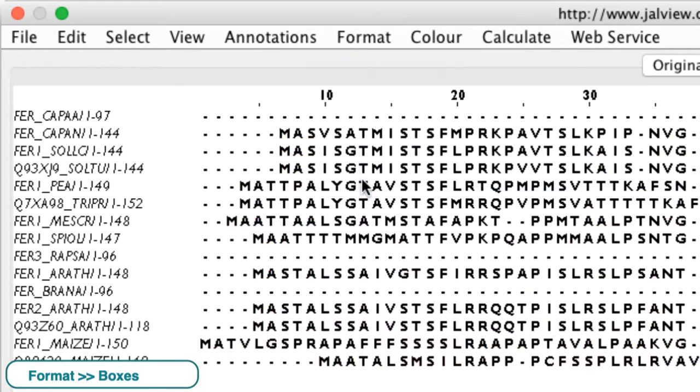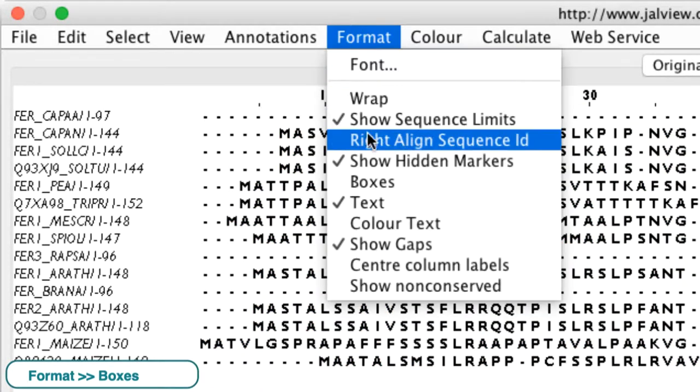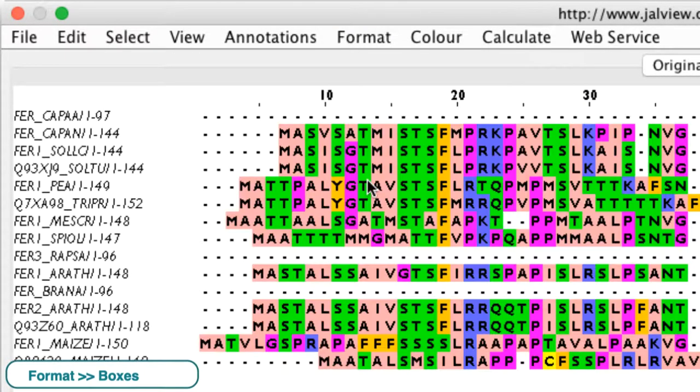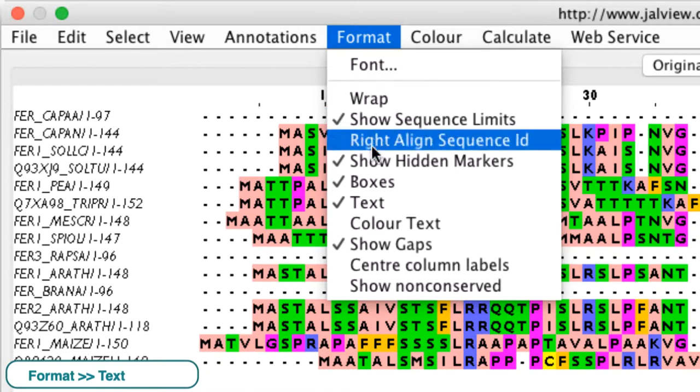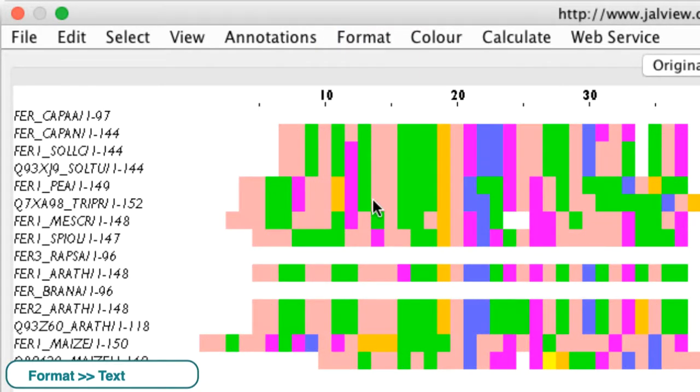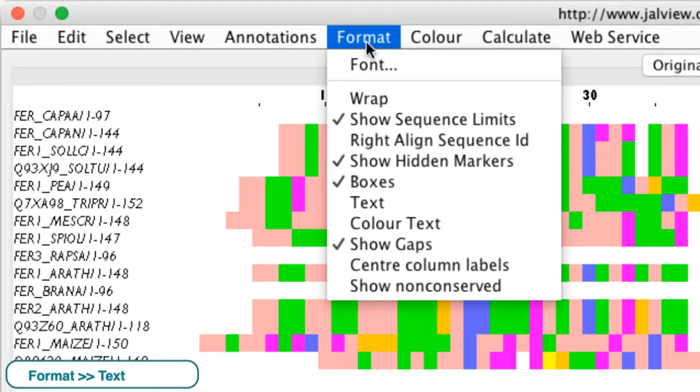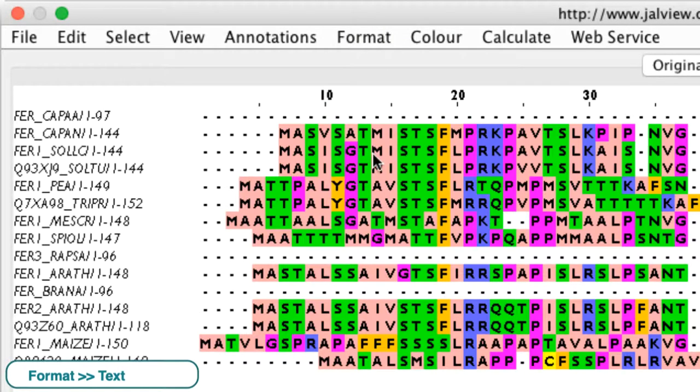Boxes toggles the background color of the residues either on or off. Text toggles the one character amino acid identifier either on or off.